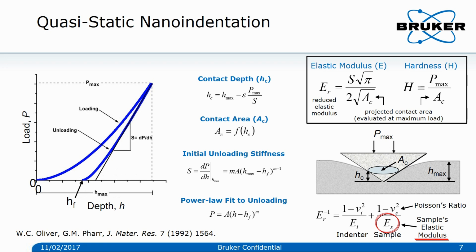In the nanoDMA experiment, the fit to the unloading curve is replaced by observing a small oscillation of the tip with high frequency at the maximum load. The force amplitude of a few micronewton typically, divided by the displacement amplitude of a few nanometer typically, results in the stiffness reading, without unloading the indenter.